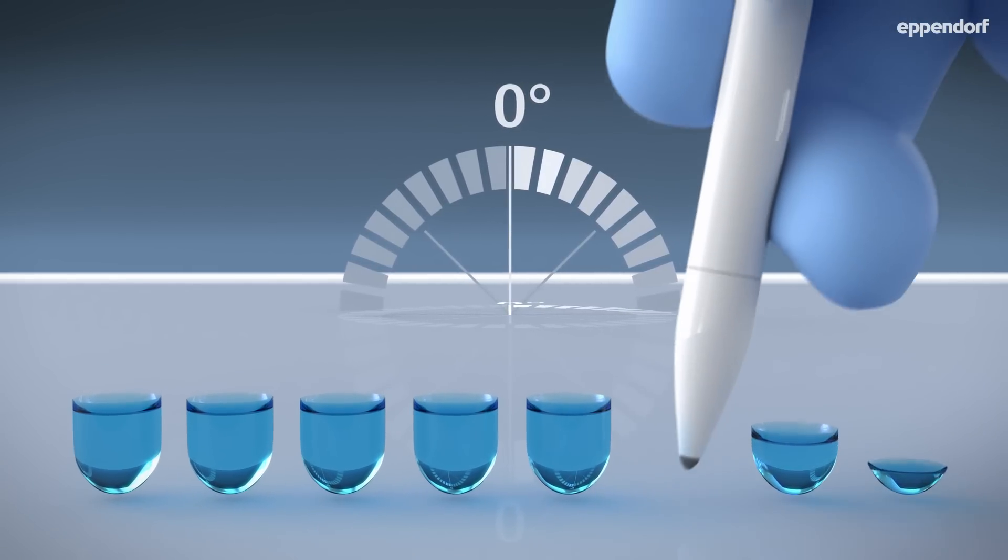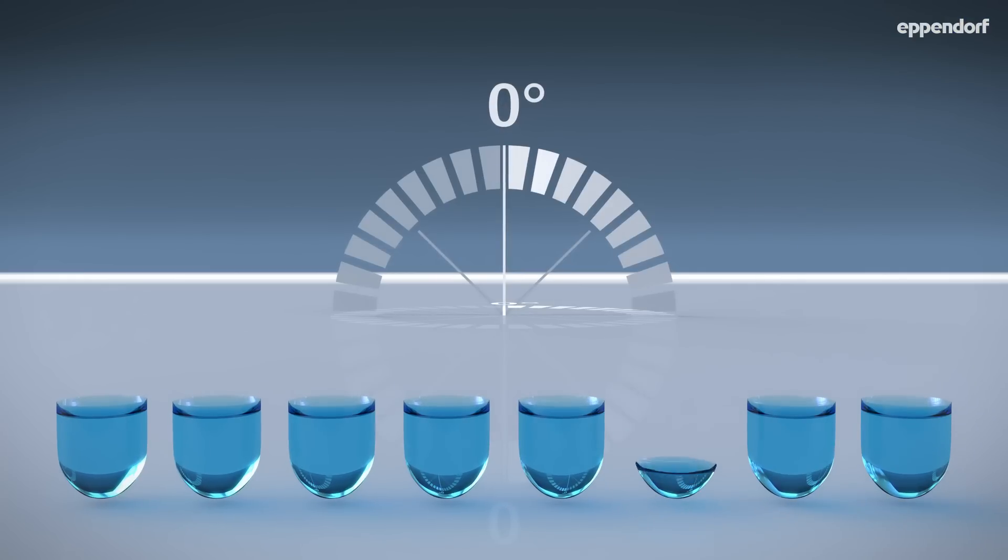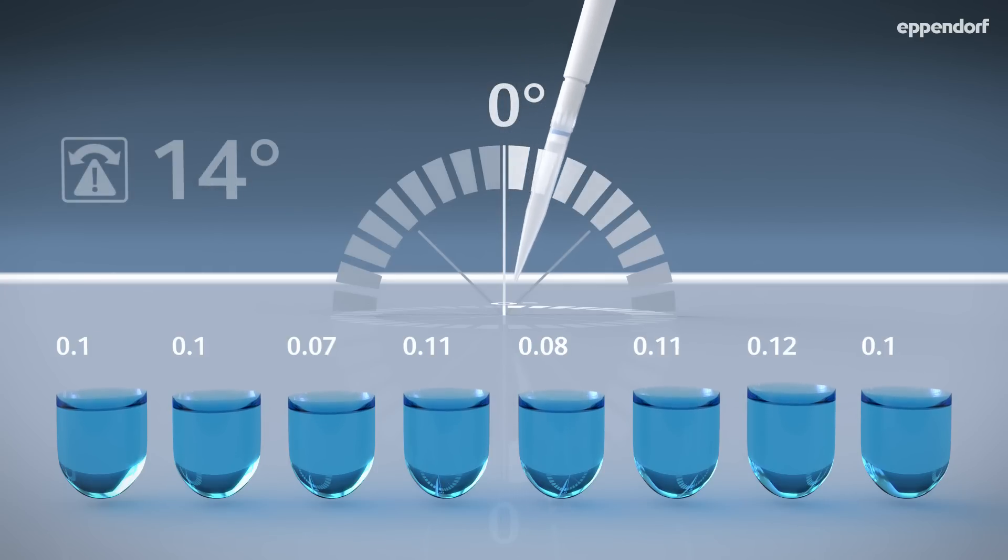Whoops! There we go. The more you tilt the pipette, the more variations you will get in a series of samples, since hydrostatic pressure in the tip changes with the angle.